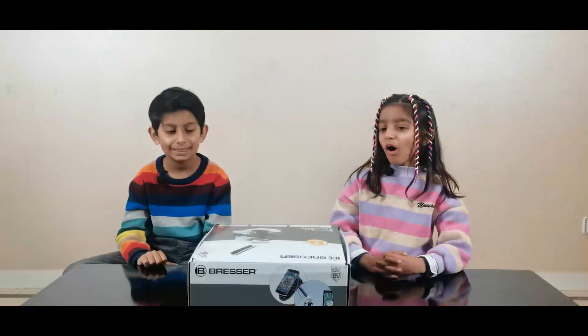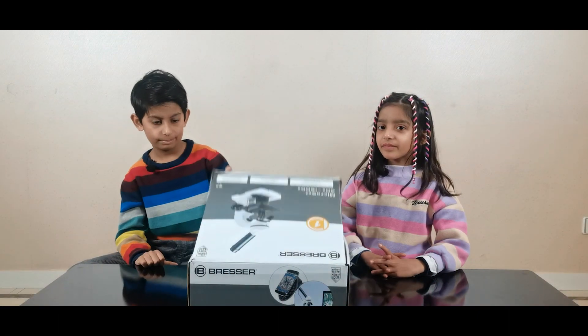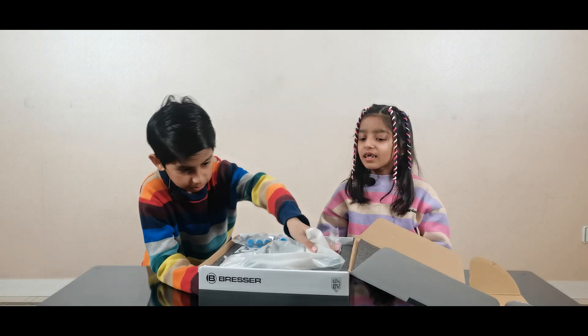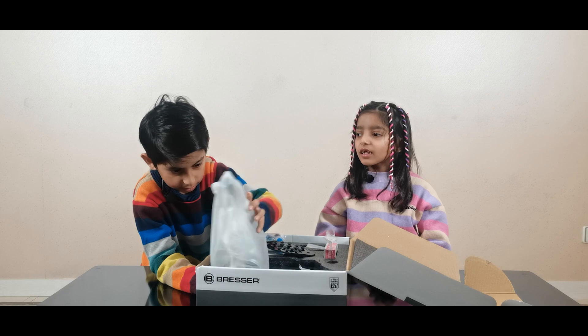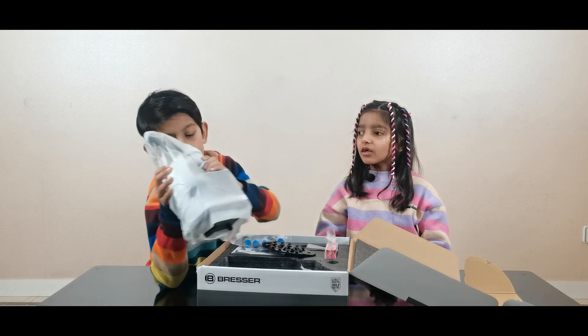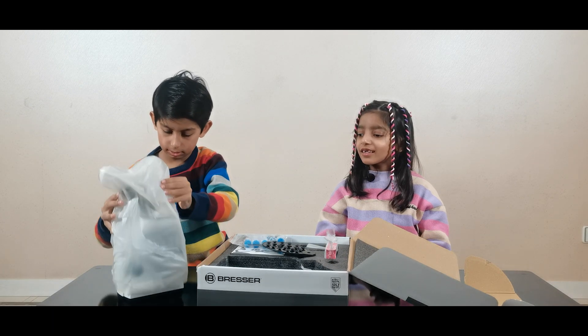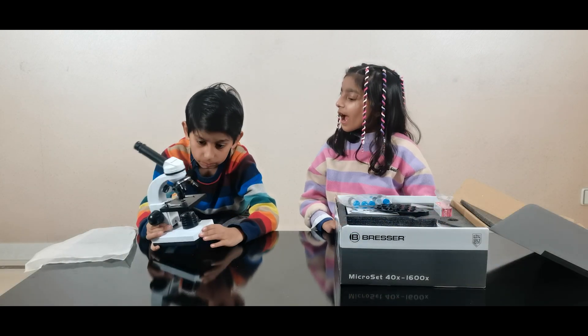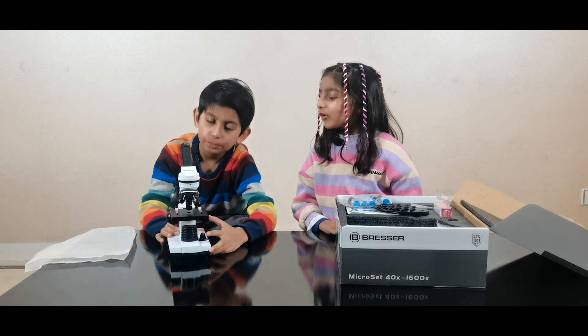Let's open it! Look at the microscope. We open it like this. Wow, it's so interesting. It's so beautiful!